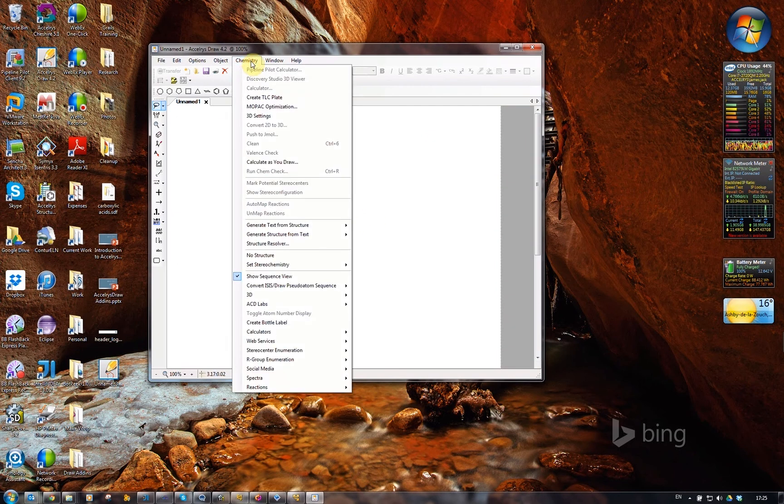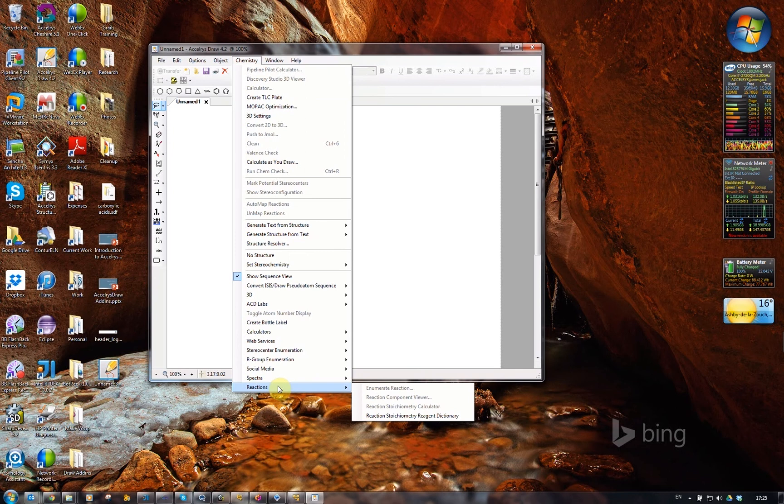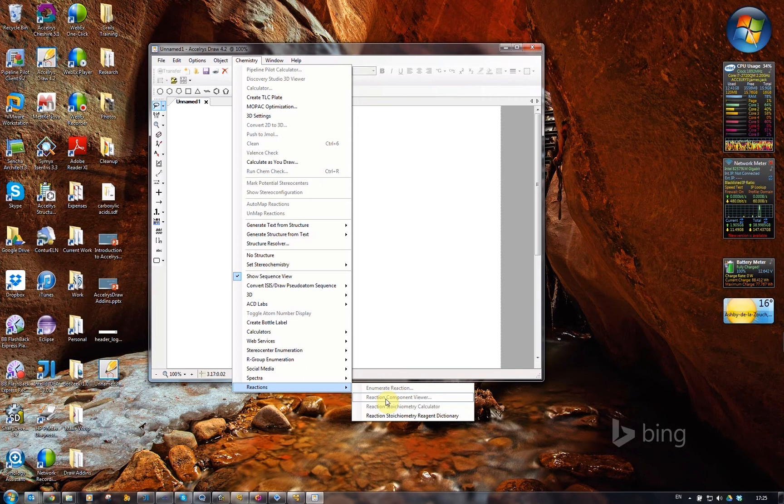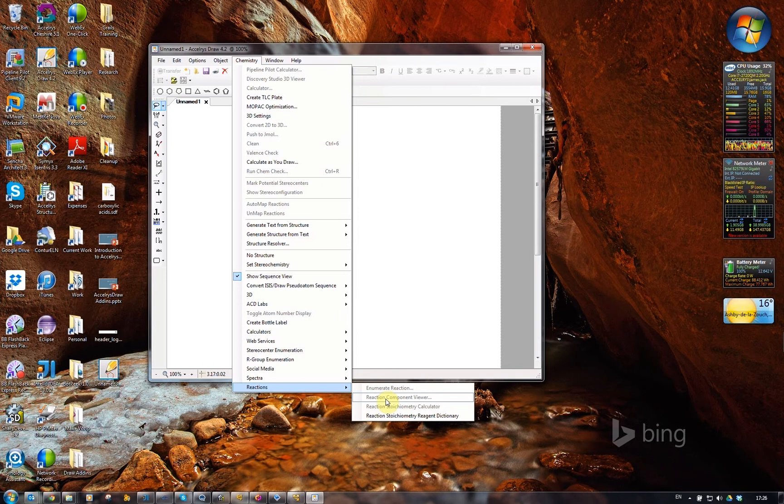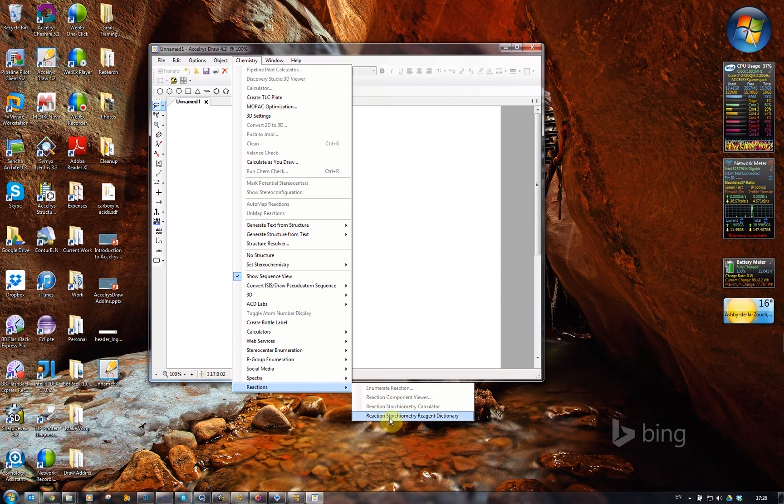There are essentially three reaction related tools in the group of add-ins that currently exist for Accelerys Draw. There's an Enumerate tool, a tool called Reaction Component Viewer, which takes the molecules from a fully drawn out reaction and converts them into an SD file so you can look at the properties more easily, and then the Reaction Stoichiometry Calculator, which is associated with the Reaction Stoichiometry Reagent Dictionary.